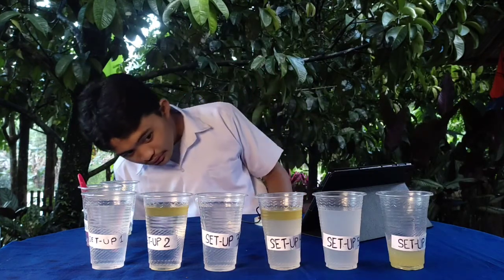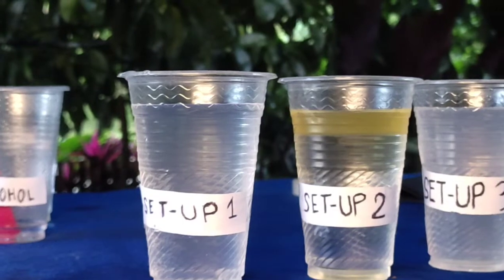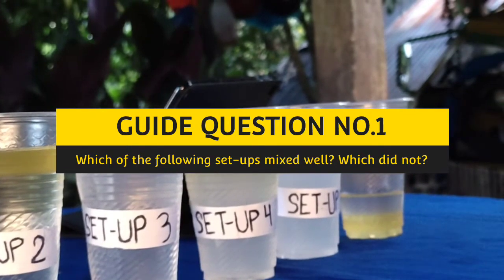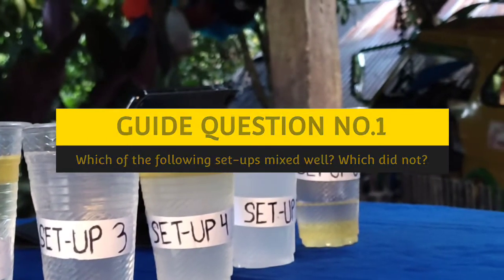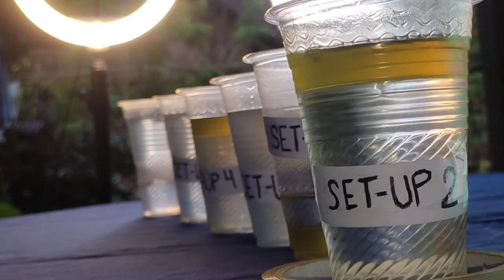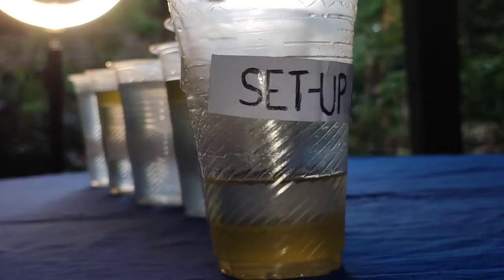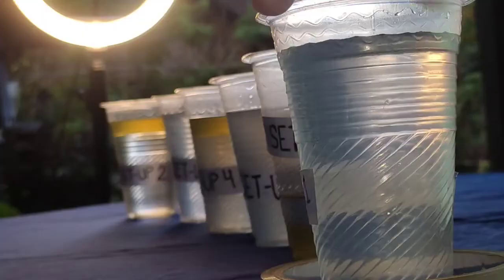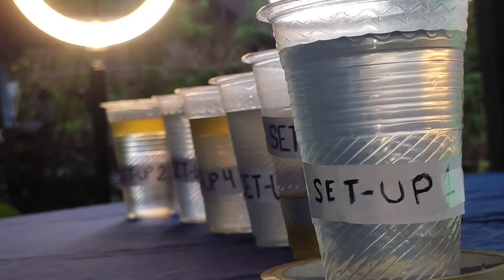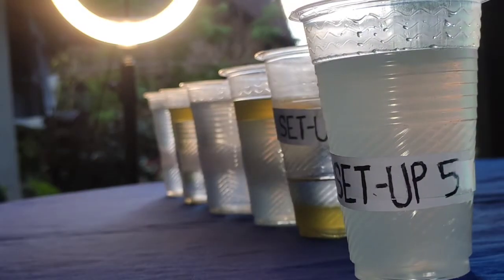Let's observe it carefully. Now let's answer the guide question: which of the following setups mixed well, and which did not? The setups that did not mix well are setup 2 — water plus oil; setup 4 — vinegar plus oil; and setup 6 — oil plus alcohol. The setups that mixed well are setup 1 — water plus vinegar; setup 3 — water plus alcohol; and setup 5 — vinegar plus alcohol.